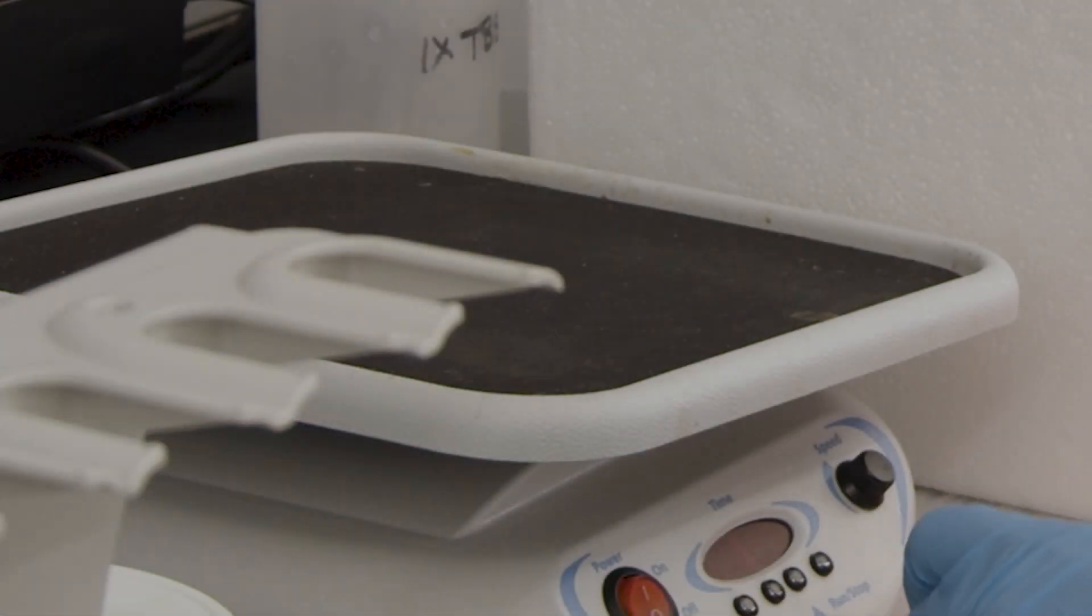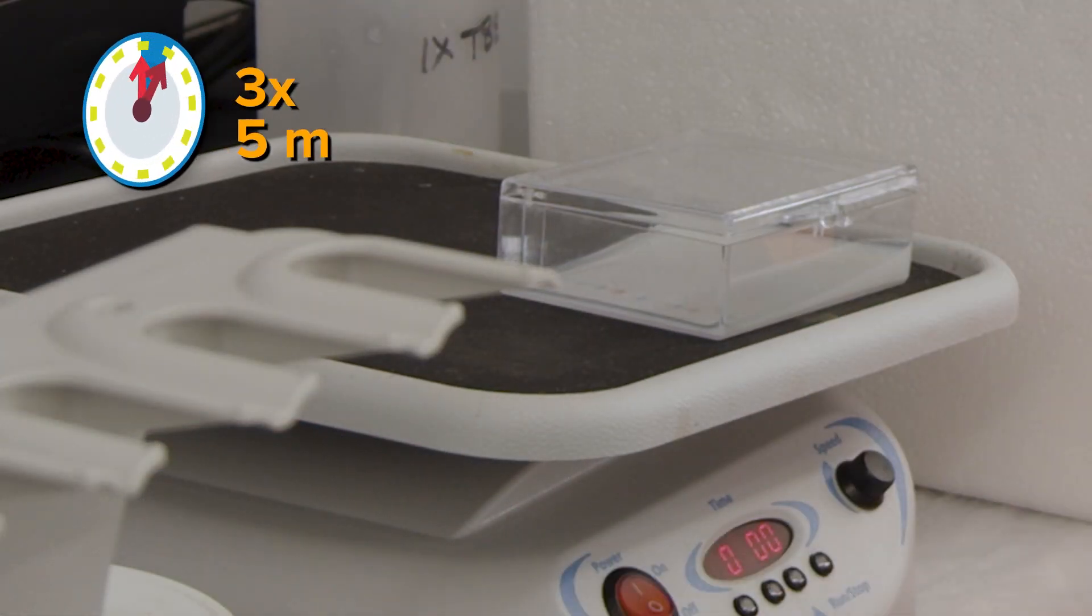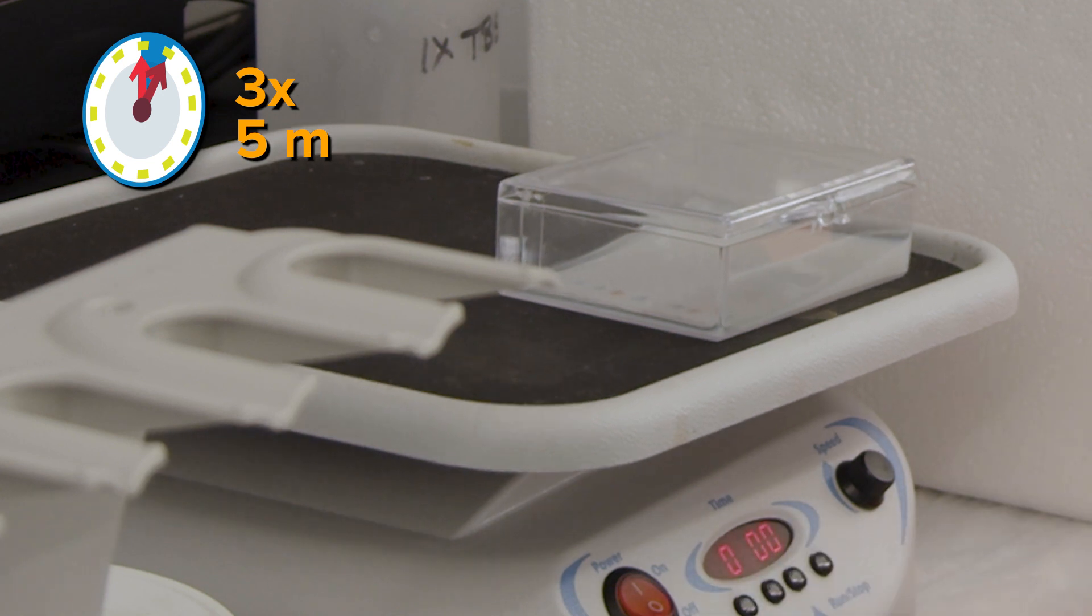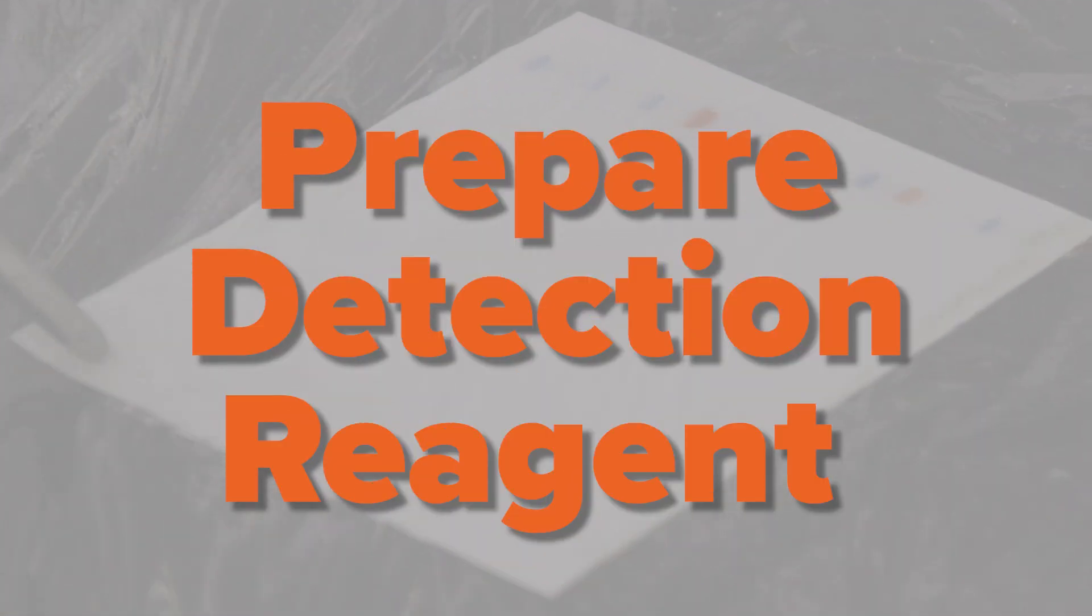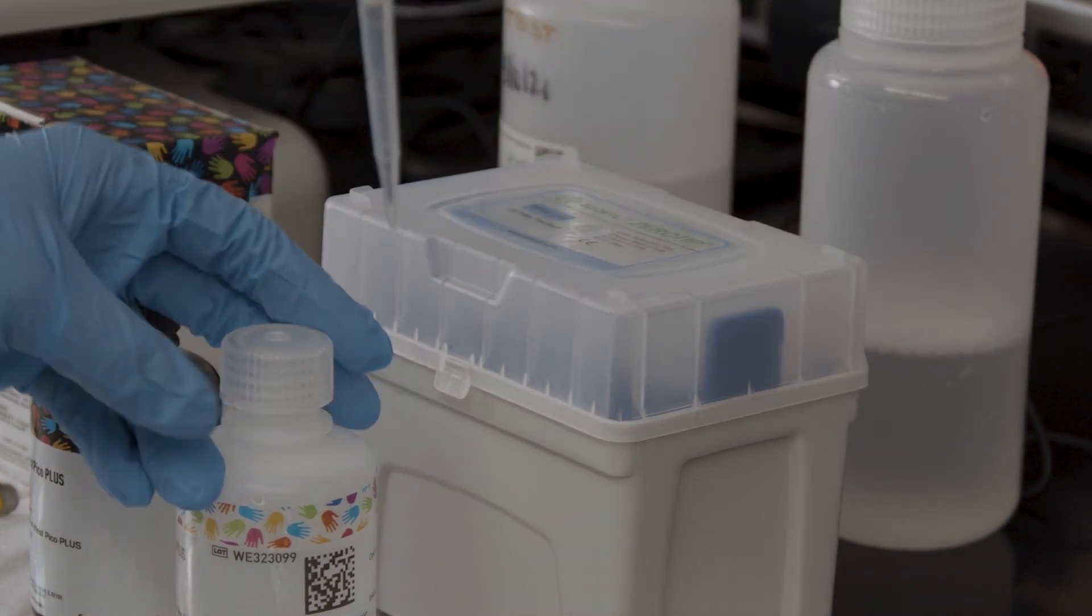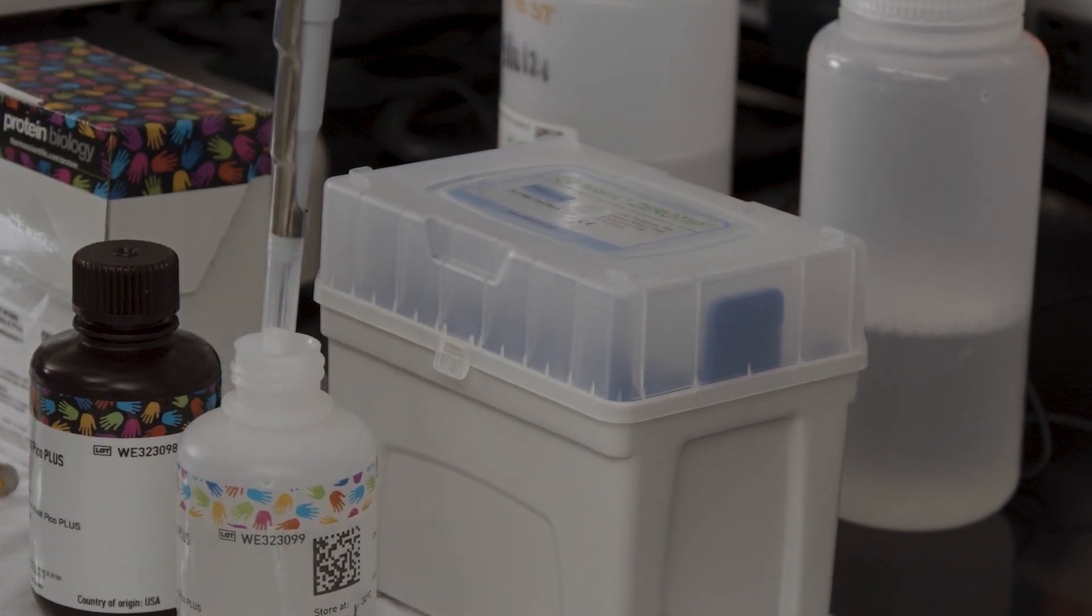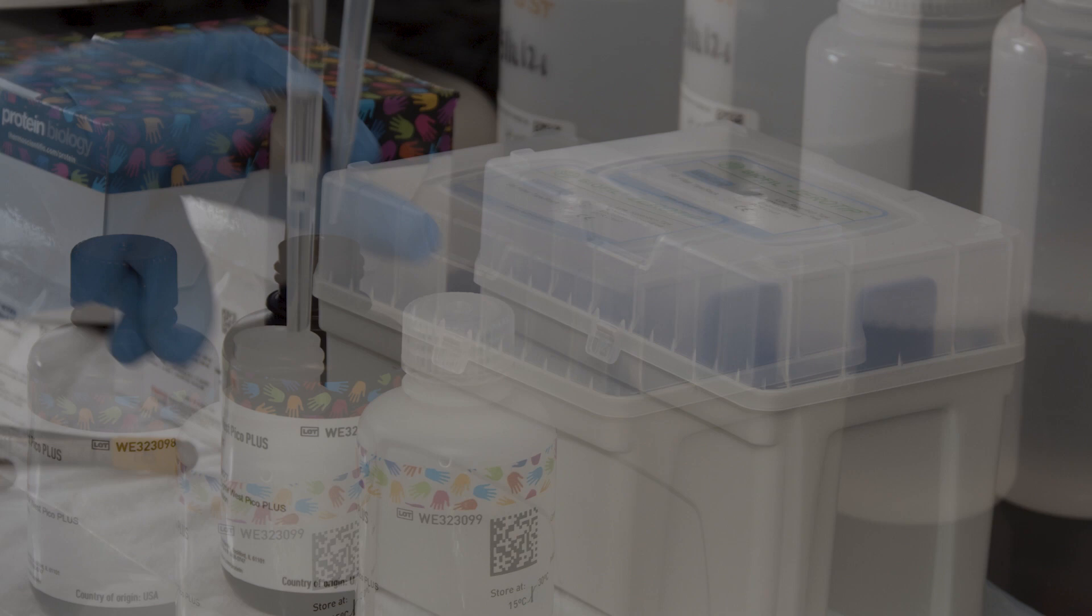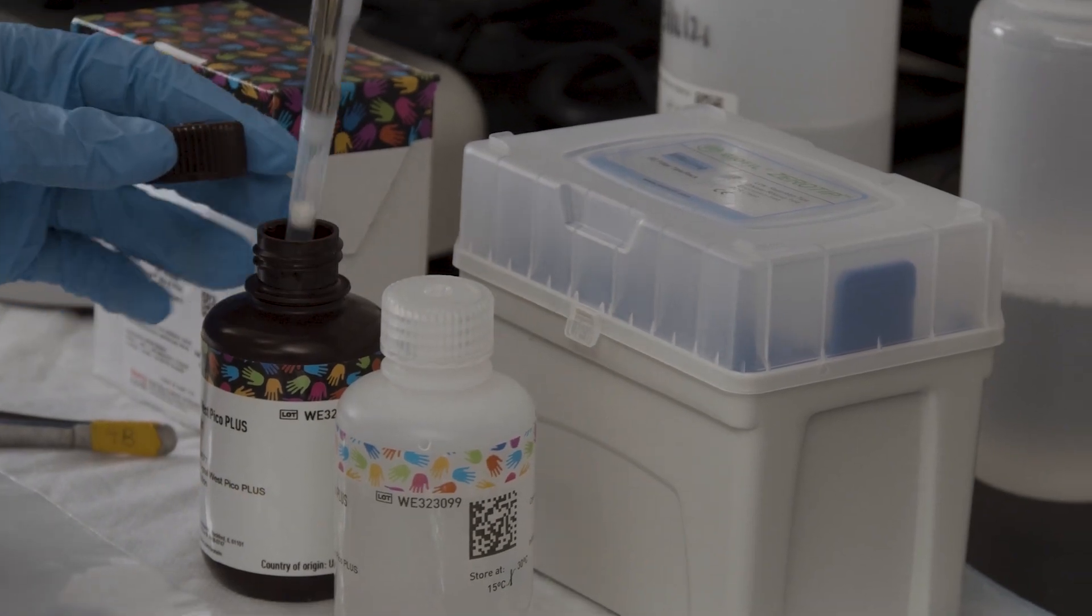After incubation, wash the membrane three times for five minutes in the wash buffer. During the third wash, prepare the detection reagent. The specific detection reagent used will depend on the conjugation of the secondary antibody, but it's typically horseradish peroxidase or alkaline phosphatase. For the horseradish peroxidase detection method, combine a one-to-one mix of solutions A and B on a piece of plastic wrap.